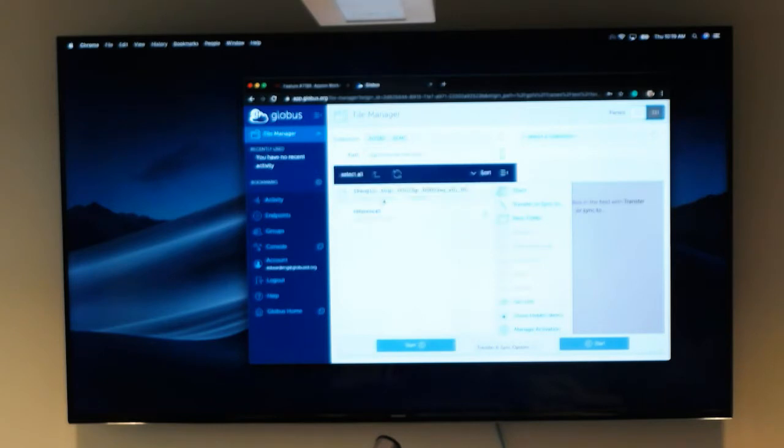And if you look in your test, so here's just a test account. So here is a movie stack. And then within the frames folder, you have your references. And remember, in this case, I guess this is a super resolution data set. If you remember, we have several different gain references.